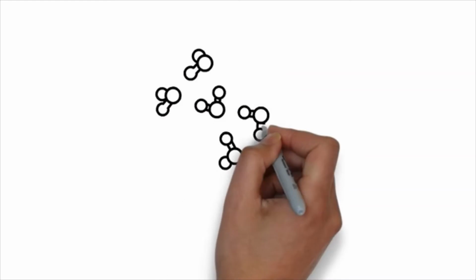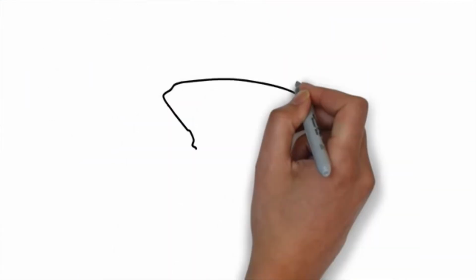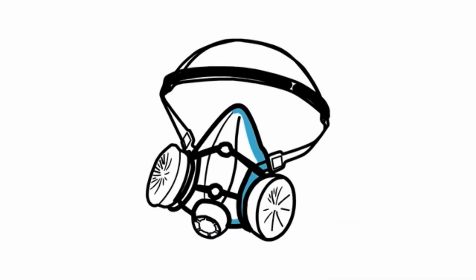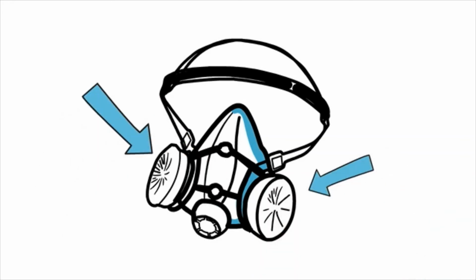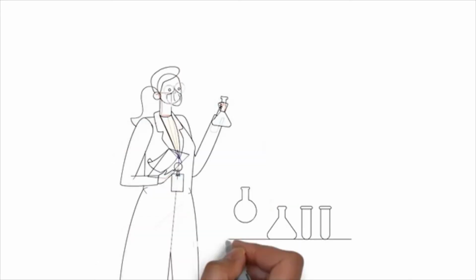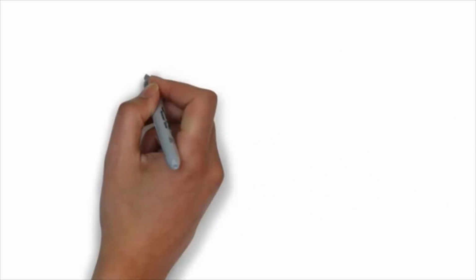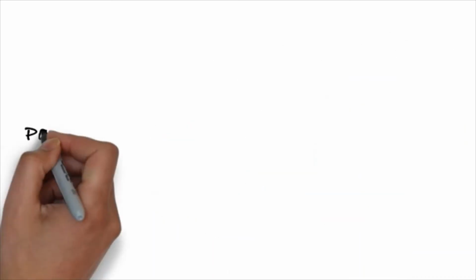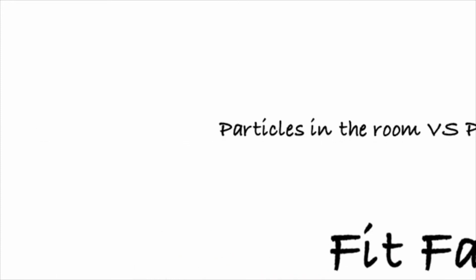Well, how does the ambient aerosol method work? The system measures the concentration of ultrafine particulates in the ambient atmosphere, and then measures the concentration of these ultrafines, which are also frequently referred to as respirable particulates, in the breathing zone of the respirator, while the test subject is actually moving and breathing. Then the system measures the ambient concentration again, computes an average of these two values, and compares that value to the concentration inside the breathing zone. The resulting ratio is the fit factor, which is a real measure of how well the respirator actually fits.